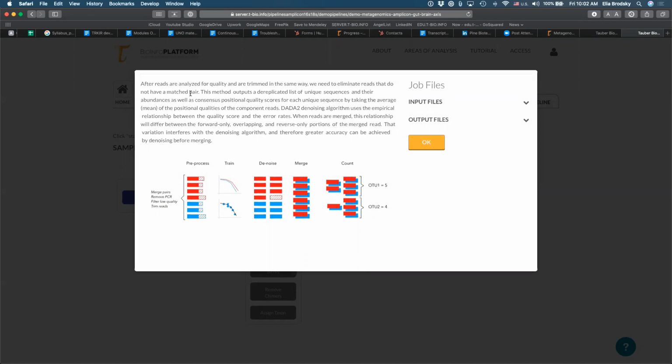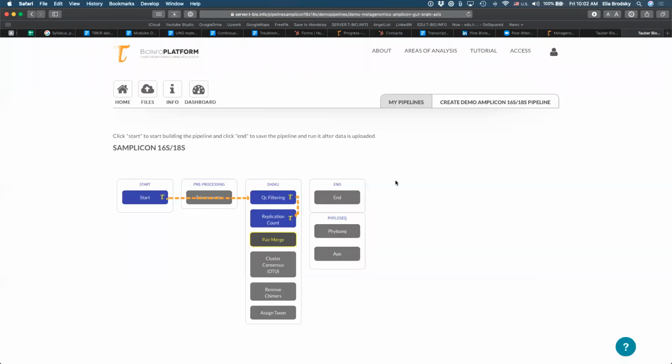We're looking at taxonomy. To look at taxonomy, we're looking at repetitive information as a single data point. So we don't want all of the reads and the number of reads. We just want to combine the ones that have been denoised and merged, and then count them as operational taxonomic units, OTUs. Then we will combine them together in groups by similarity.